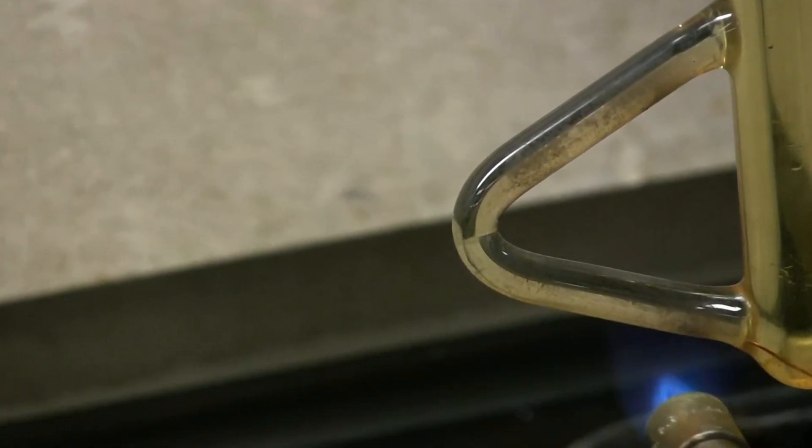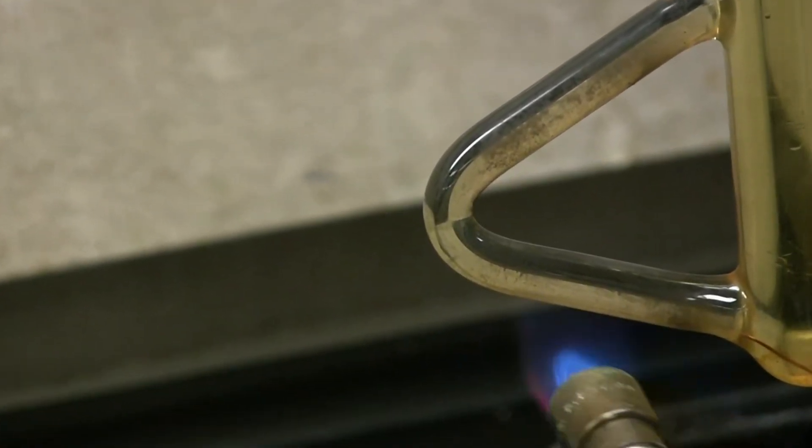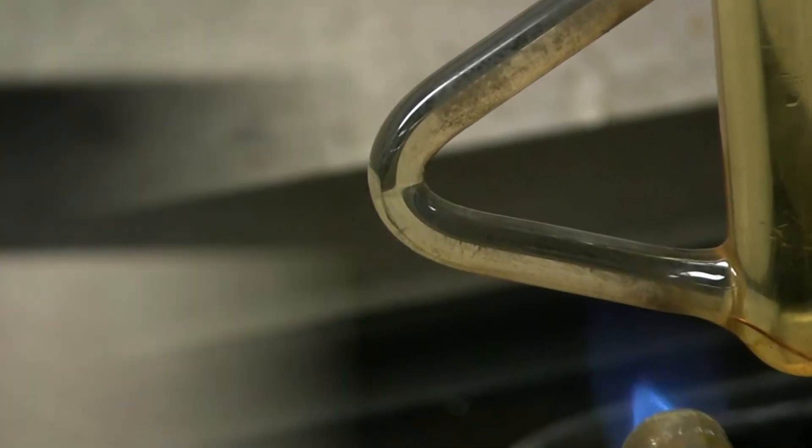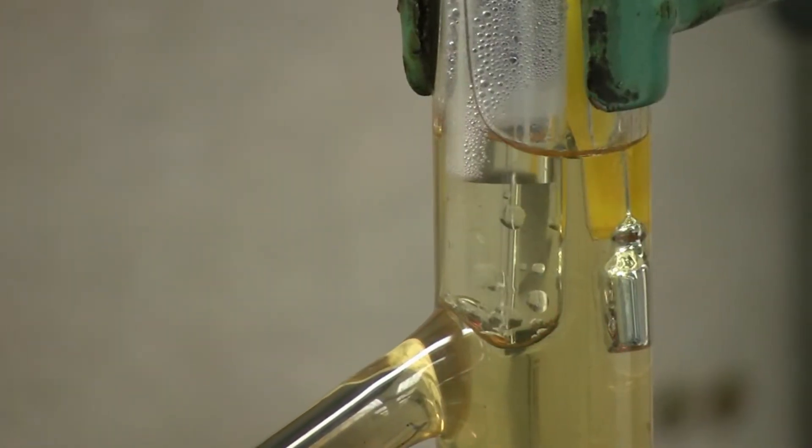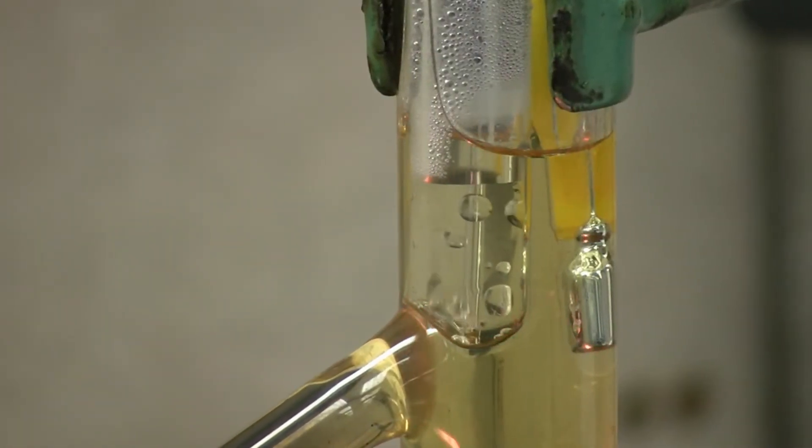You will now need to wave the Bunsen burner over the lower end of the Thiele tube to ensure even heating. Once the sample has begun to boil, remove the flame from the lower end of the Thiele tube and allow it to cool.